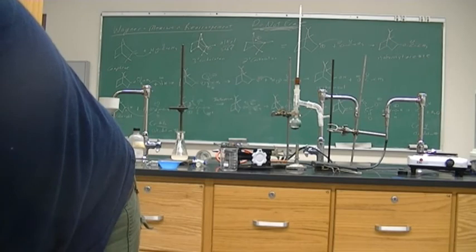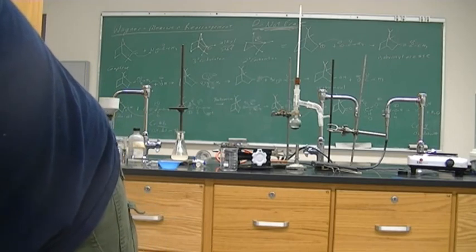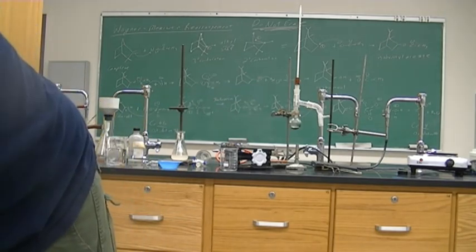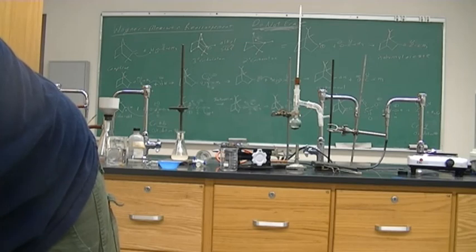All right, I'm going to increase the heating here. Oh boy. It is at 150 and still not melting. 165 and it melted at 165. So the melting point that we have is 165. And it is a liquid.